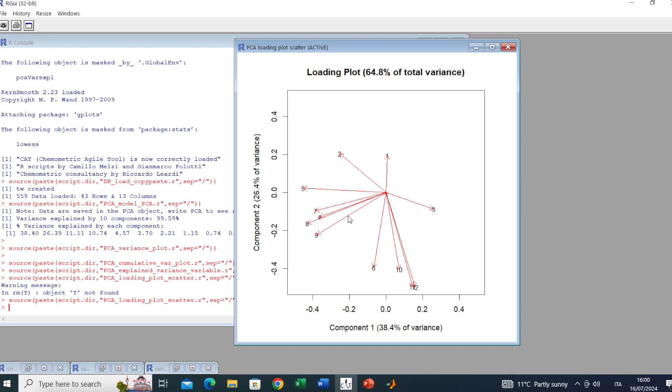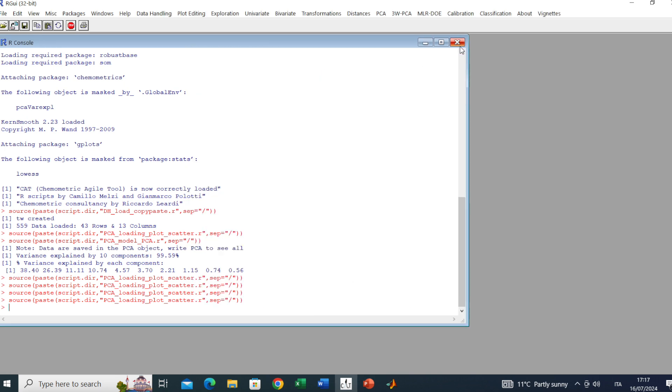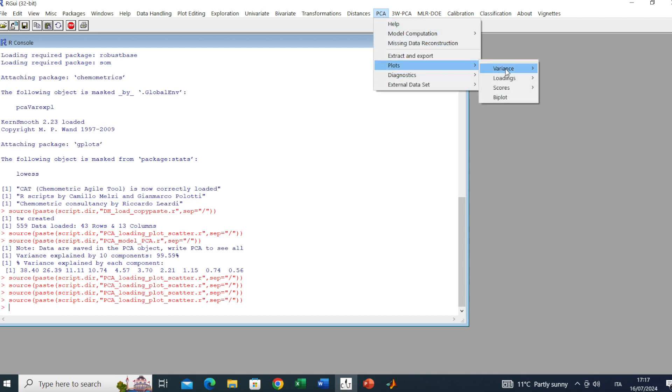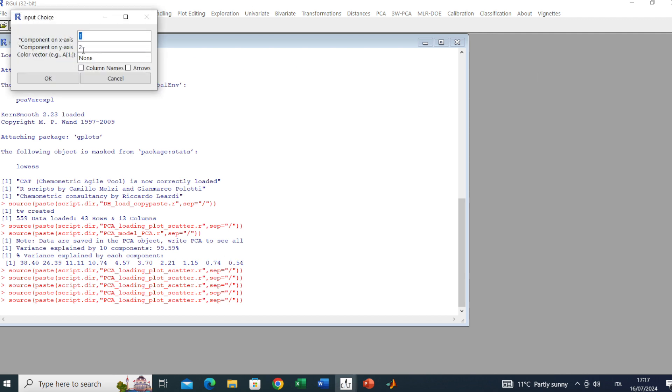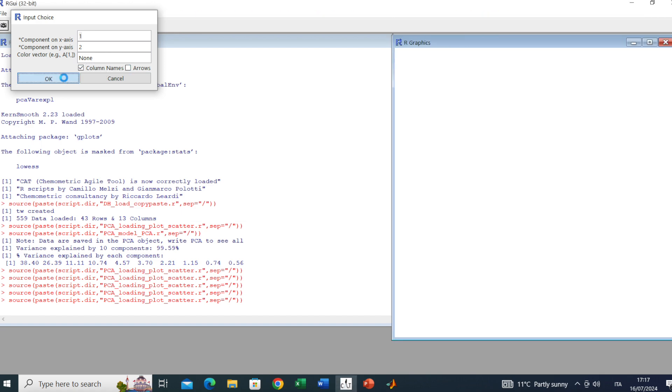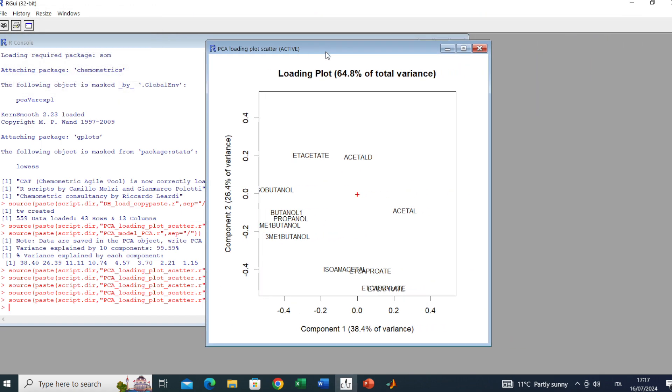If we go on without checking it and selecting arrows, we will get this loading plot where we have arrows used to interpret the correlation structure. Now let's do this plot again by using the column names. We go to PCA, Plots, Loadings, Scatter and we check column names without arrows. Here we get the typical loading plot.